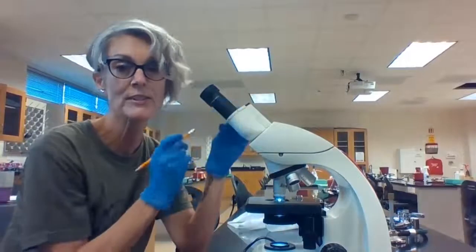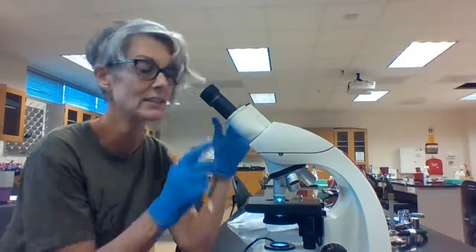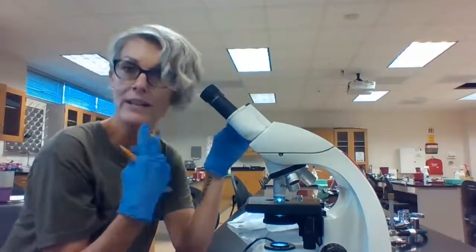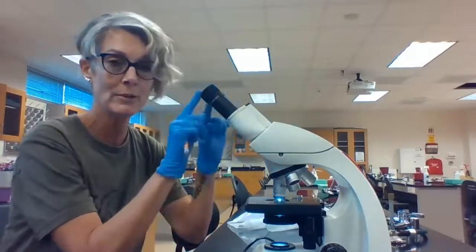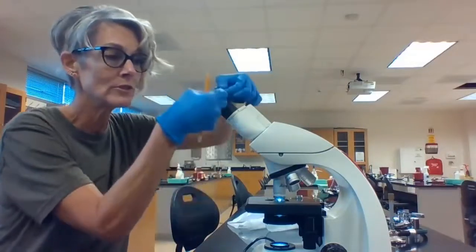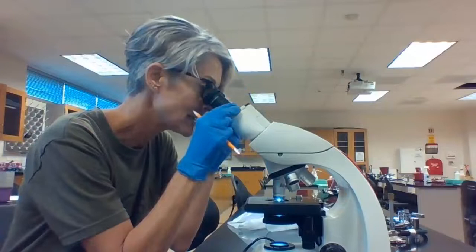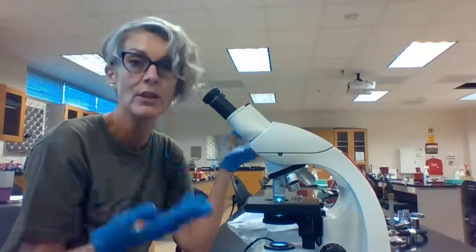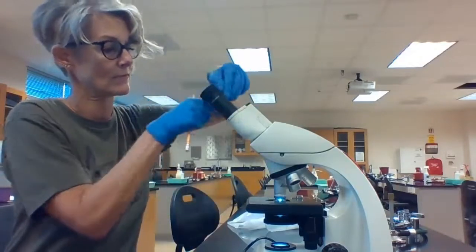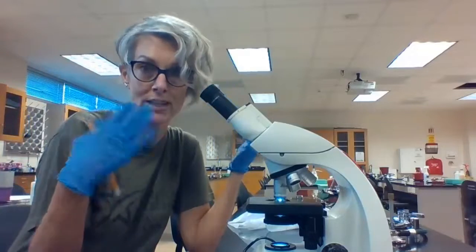These are the ocular lenses. This is a binocular scope, meaning that there are two ocular lenses, so you don't have to do the squinty-eye thing. These are adjustable so you can set them to the width of your eyes, whatever's comfortable for you. The eyepieces are rubbery at the top. If you wear glasses, you're going to want to fold down that rubber lip so you can press your glasses up against the lens without having to take them on and off. If you don't wear glasses, flip up these rubber rims — this will eliminate the light coming from the side when you're viewing your specimen.